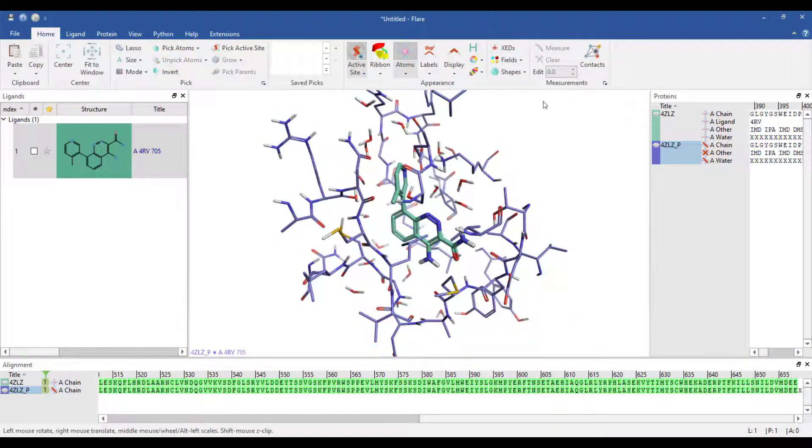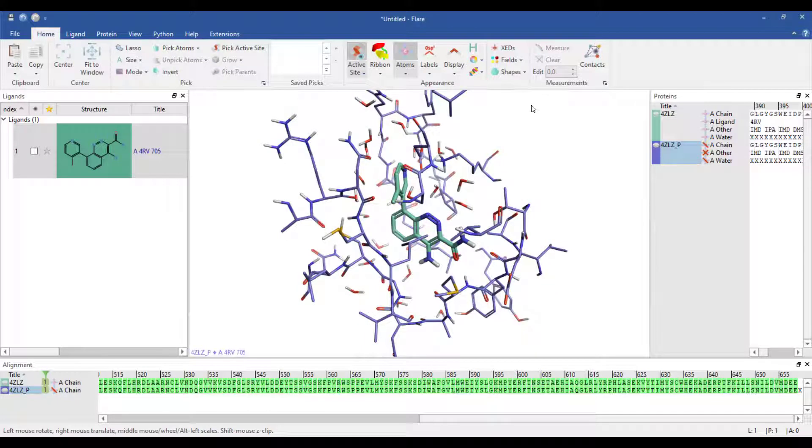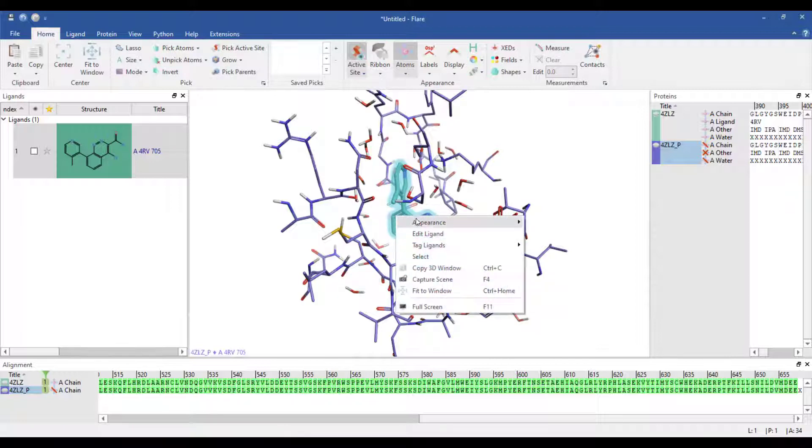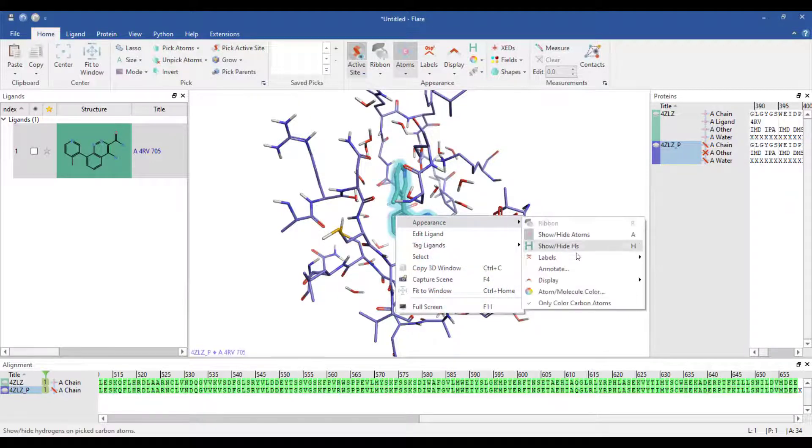The ligands representation style can be changed to ball and stick in a similar way, or alternatively I can select the ligand, right click and pick from the resultant pull down menu.